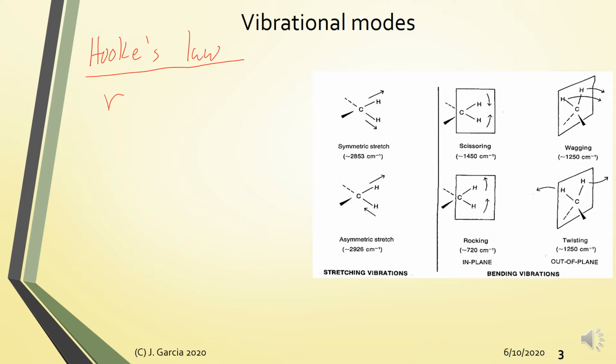So the way we imagine molecules is that you have two masses connected by a spring. To induce vibration along the spring corresponds to a certain value of frequency.